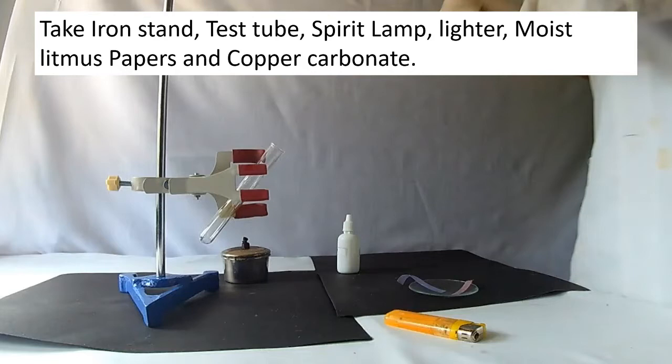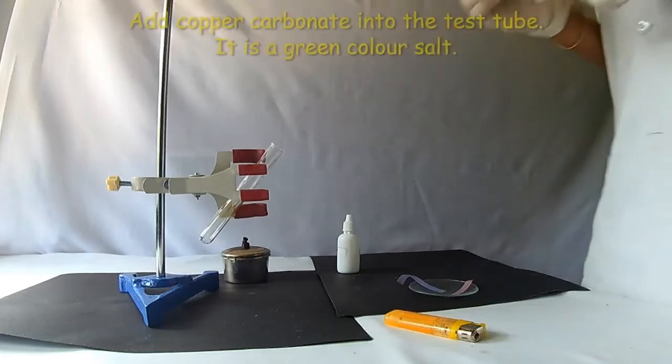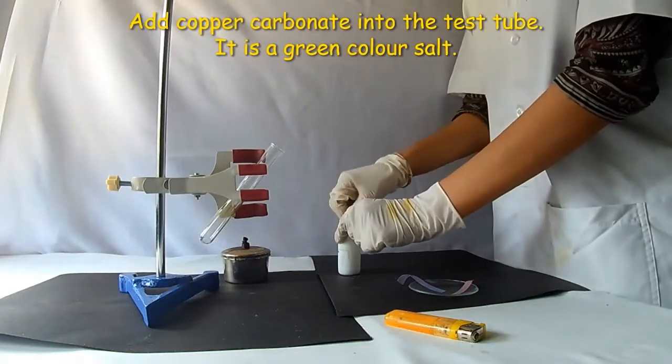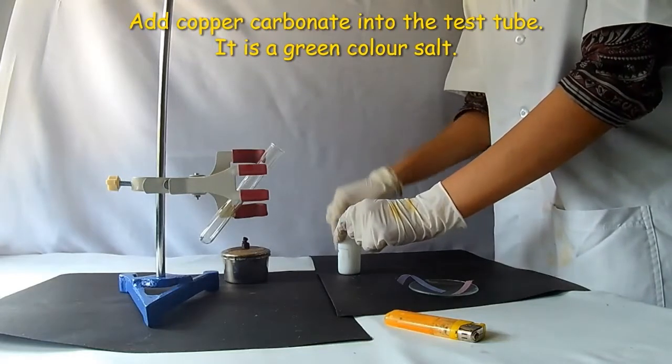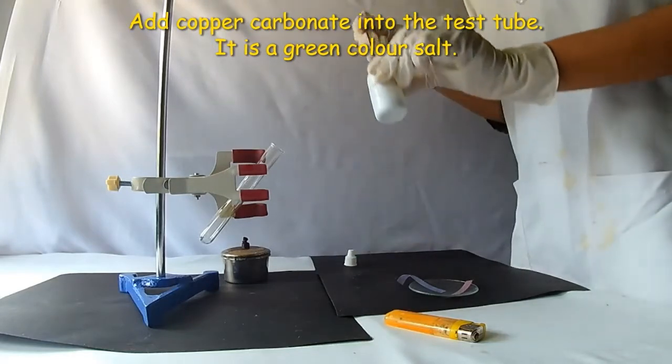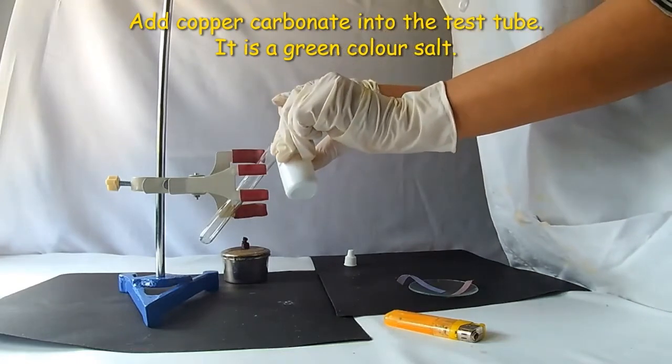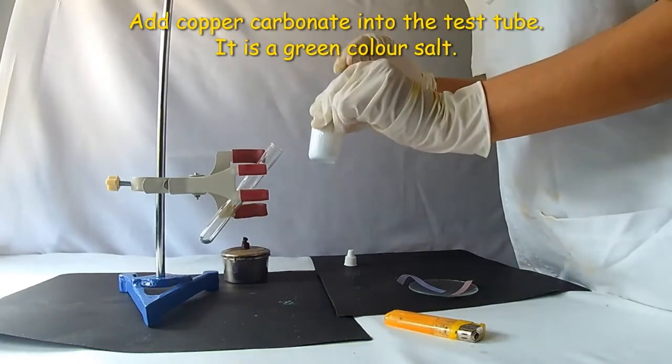Fix the test tube onto the iron stand carefully. Now, add copper carbonate into the test tube. Observe the color of the salt. It is a green color salt.